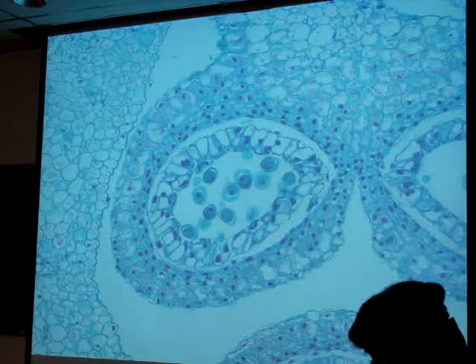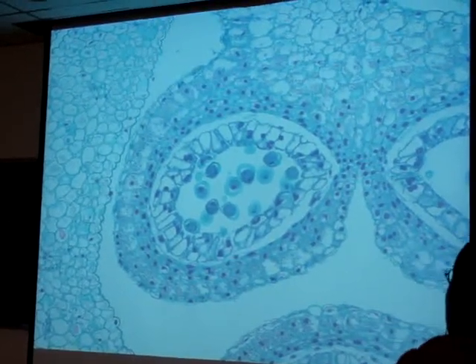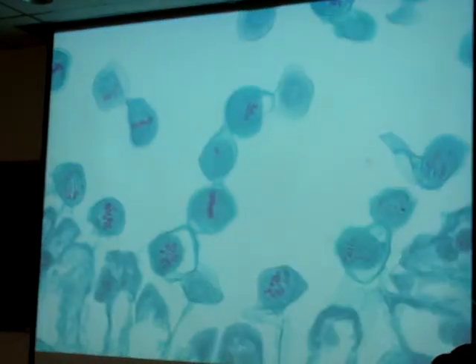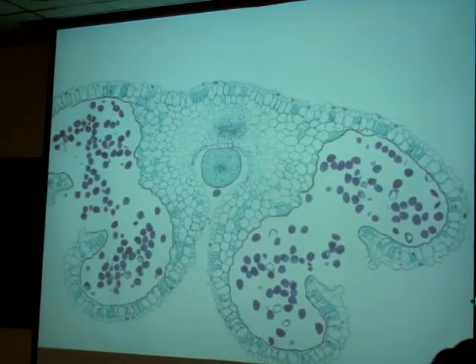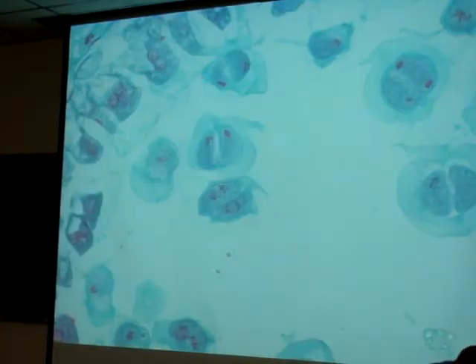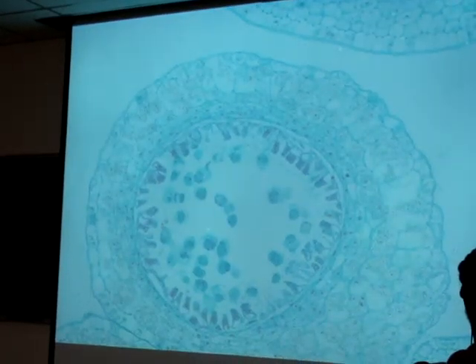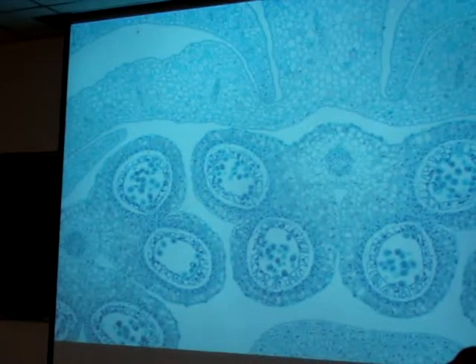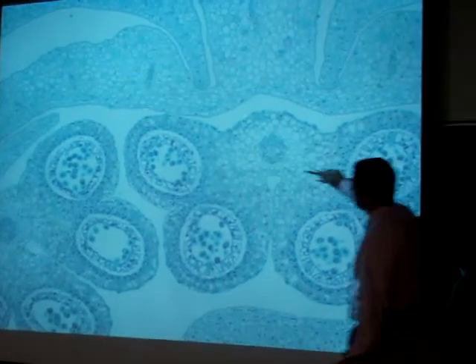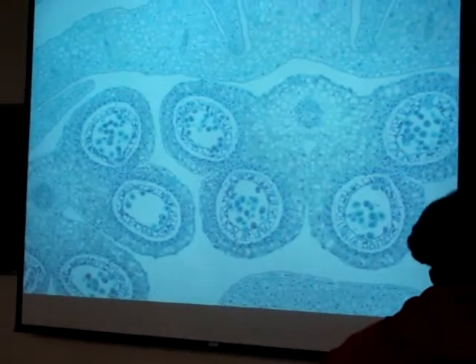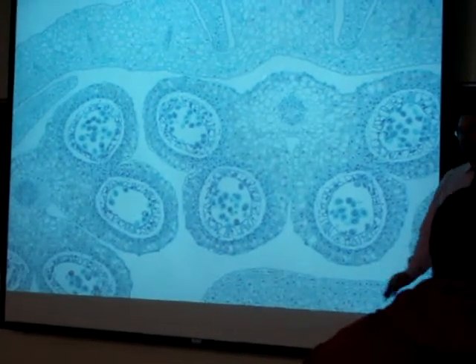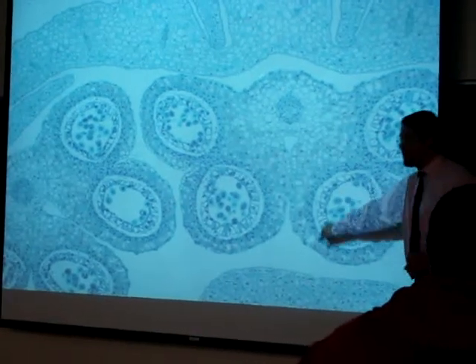The difference between first division and second division is very subtle. Let me see if I can find one second division that I like. The anther sac is the little subdivisions inside the anther — the whole thing is the anther, and each individual chamber is an anther sac. If you can see the ring of the first division and I trick you, I promise it will come out in item analysis. The basic idea is these cells are committing to this process. I would call this first division because I see a nice solid ring.